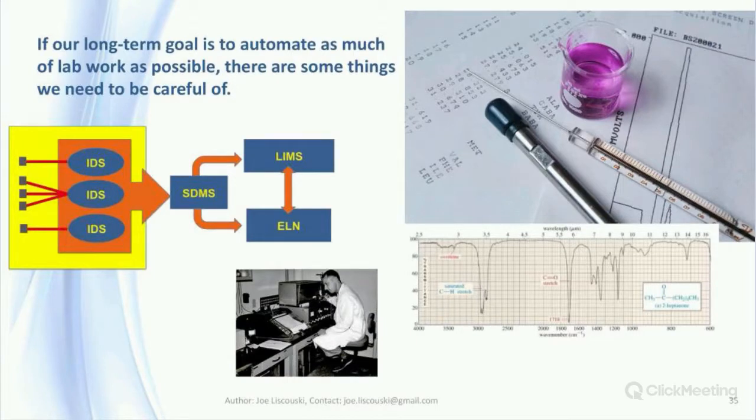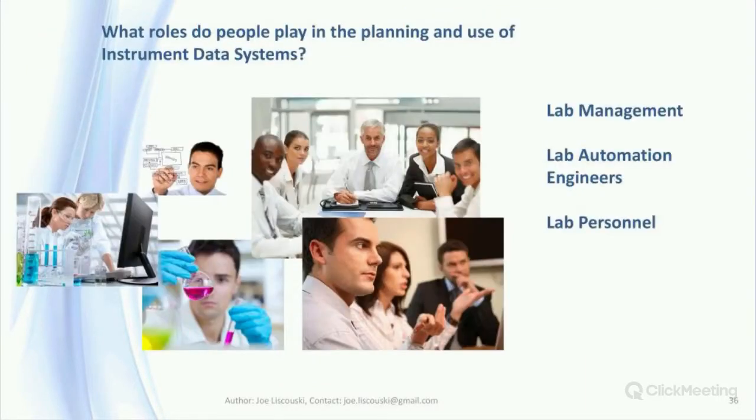The impact of contaminants is a problem in any experimental procedure. Now that we're trusting the software to do that work, is it up to the job? Are we trusting printouts that might have filtered out problems? That's for you to determine. It's a matter of making sure the equipment meets the need, and that is part of the validation process for laboratory procedures.